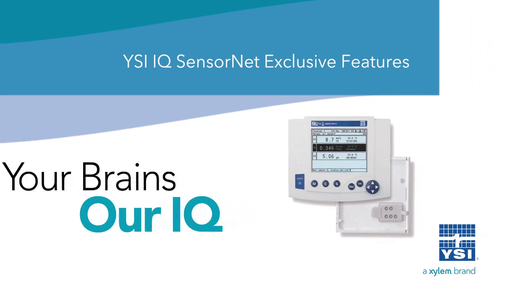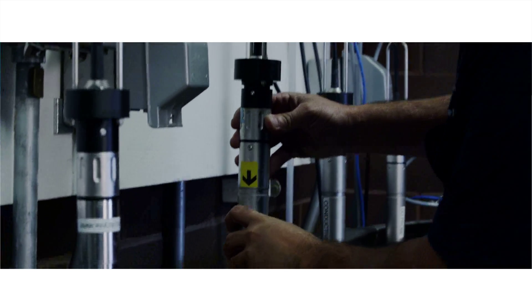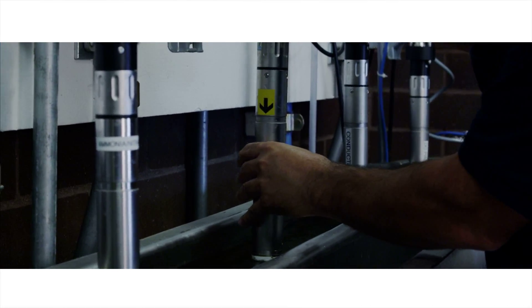And TOC. The network has the capability of connecting from 1 to 20 parameters, and is able to accept new sensors and can easily be scaled without new hardware or engineering help.